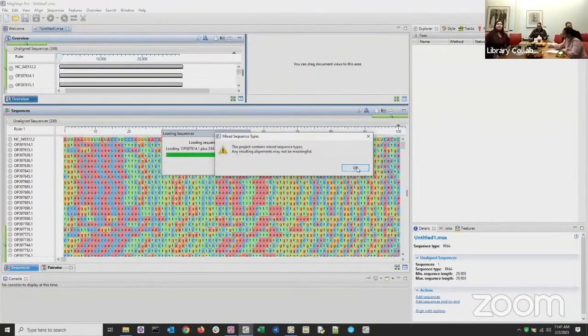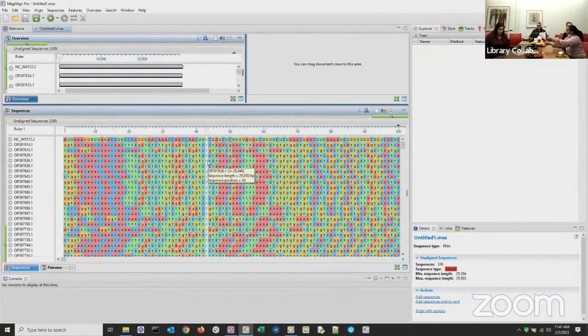The reason we developed this workflow is because in talking with a lot of researchers, we noticed that a lot of people are spending a lot of time trying to convert and translate manually different nucleotide sequences to protein translations. And so we developed this workflow to help with that.